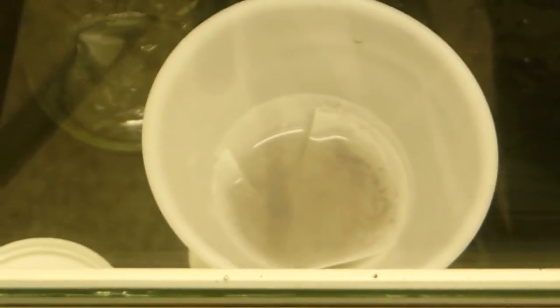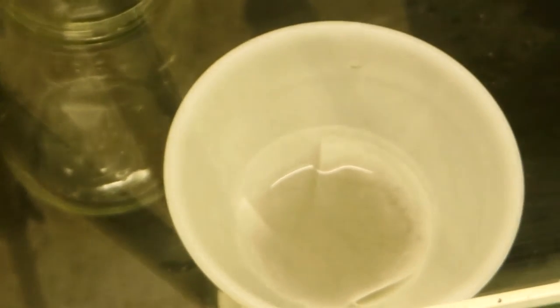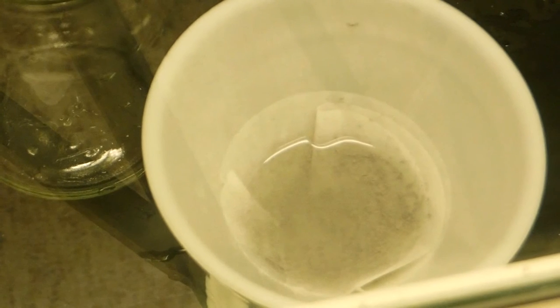The purpose of this filtration is to separate the solids from the liquid, and get rid of that liquid, and neutralize it. So I'm just left with the solids by itself. So there's another close-up.